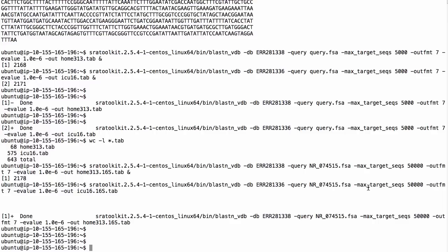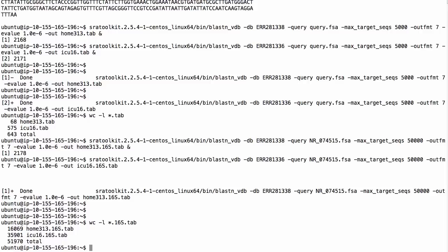The results are done. Counting the lines in the output files, the 16S 16-day ICU results have about twice as many as the 313-day at-home results. The 16-day antibiotic marker had about nine times as many results as the 313-day, so maybe there's still something here, but it's not really clear cut. Anyway, it does look like an interesting dataset, and this shows you what kind of things you can do with SRA BLAST.